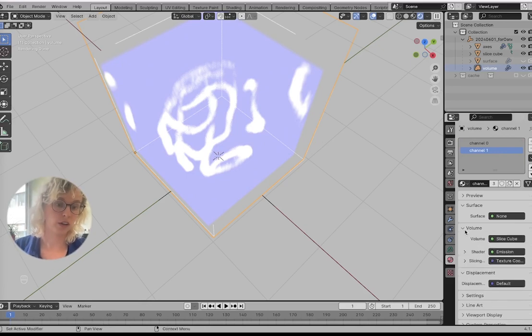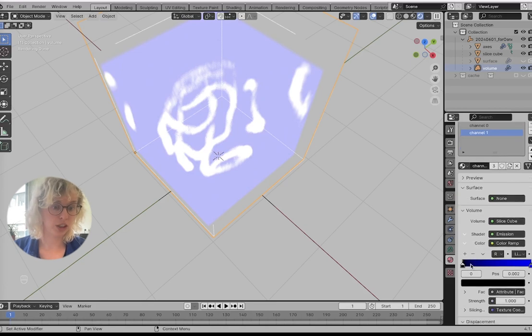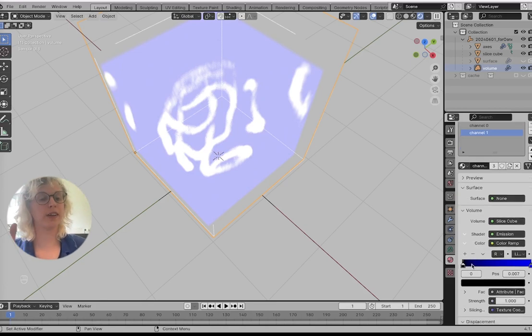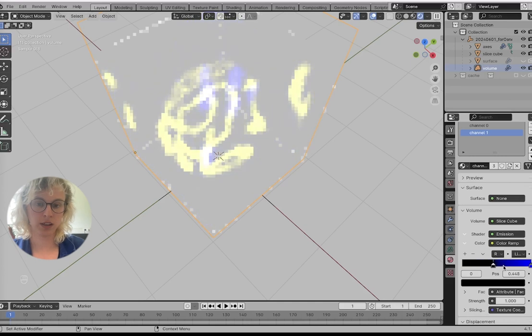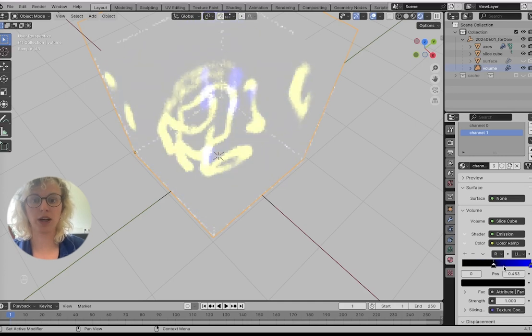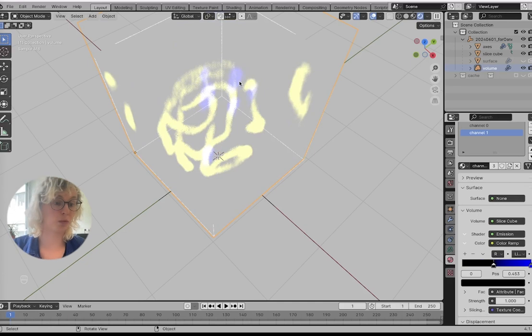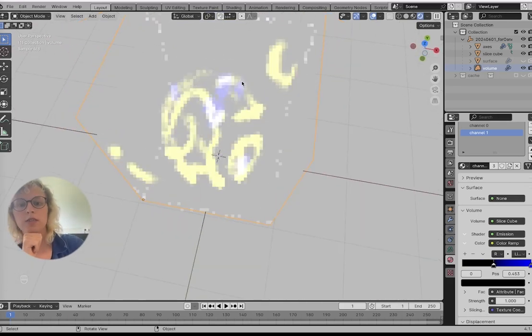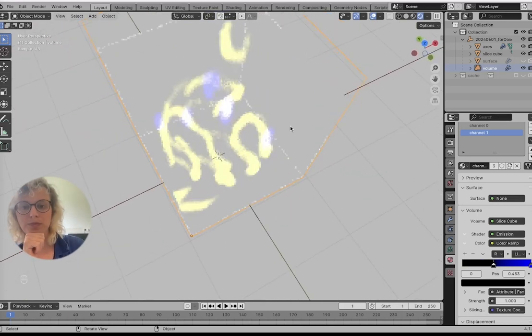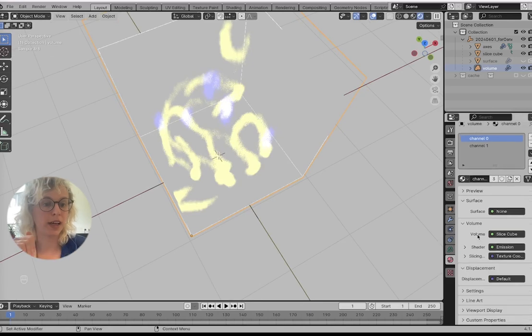we can go to how the volumes are being shown, how this emission is being shown, and here we find our color ramp, which is how we can threshold our data. So now we actually see our single spots, which makes it look a lot nicer.